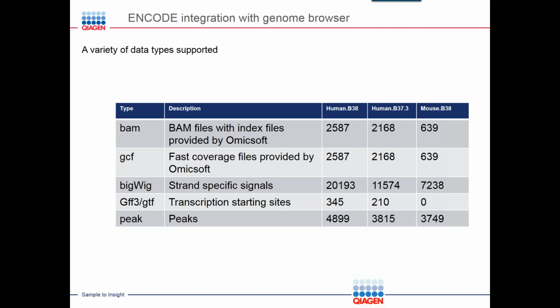so they don't have an index. Which means if you want to access a specific ENCODE BAM file, you have to download it and run some software, which of course you can use Array Studio to index it first. But the problem in practice is that the user doesn't want to download a huge file. They don't even have space to do that. It will take a long time. They just want to stream directly.